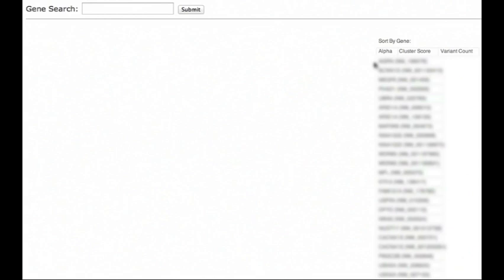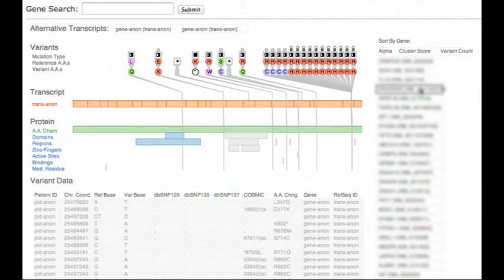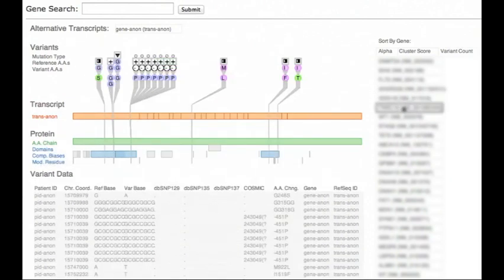We are now inspecting genes in order of the variant count metric. VariantView is designed to help analysts find candidate genes that are not already known. It has already helped them find several intriguing possibilities.